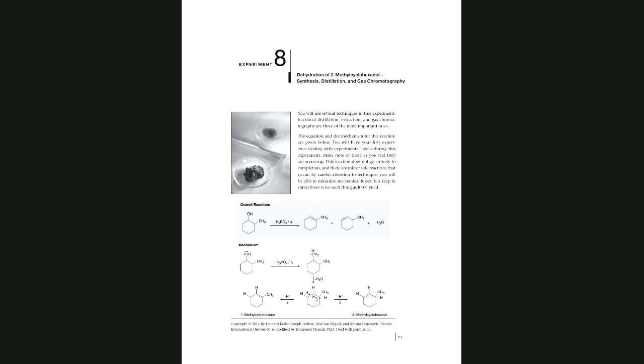When you have a chemical reaction, you want to make sure that you know what your reactant is, what your reagent is, and what your product is. If you have more than one product, which one is the major product and which one is the minor product? That is what you learn about chemical reactions in lecture as well as in the lab.